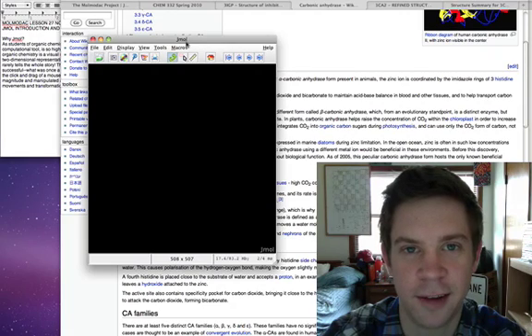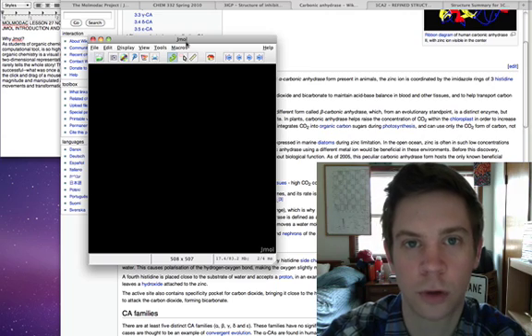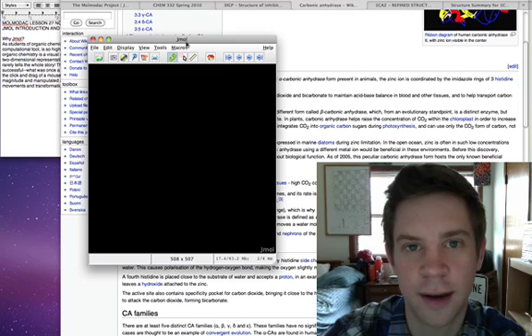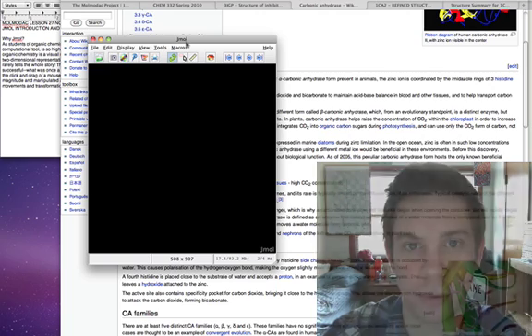In this series of webcasts, I'd like to take you through some of the things that Jmol can do and some of the more common workflows that you'll find yourself engaging in as you manipulate your structures. And the example I'm going to use is that of carbonic anhydrase, which is an enzyme that catalyzes the decomposition of carbonic acid into bicarbonate and proton.